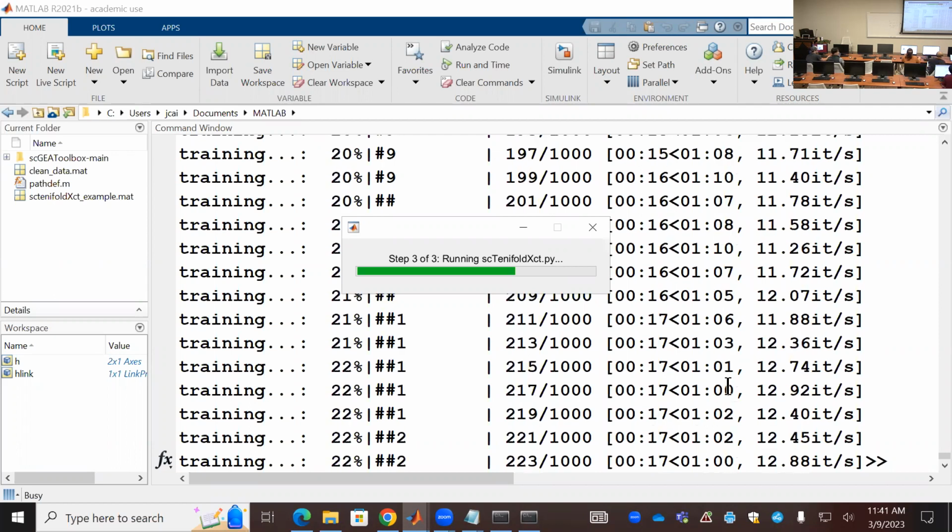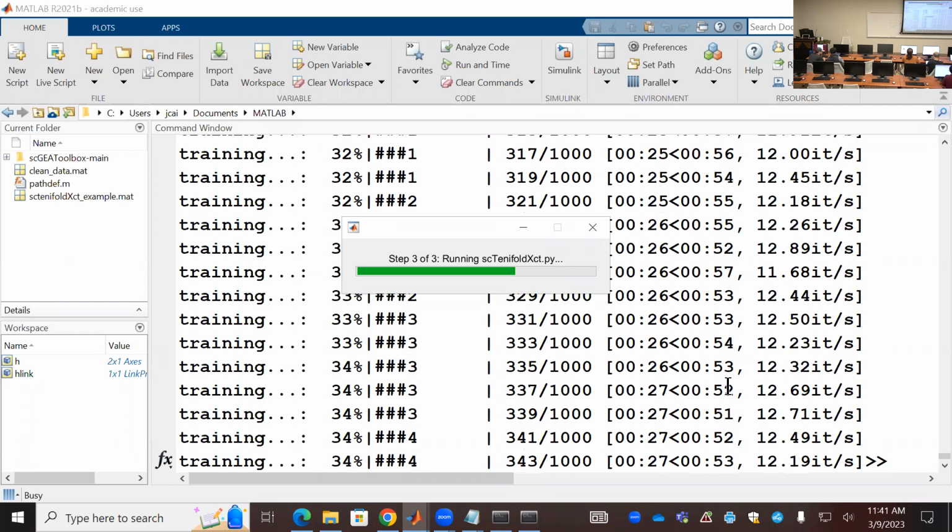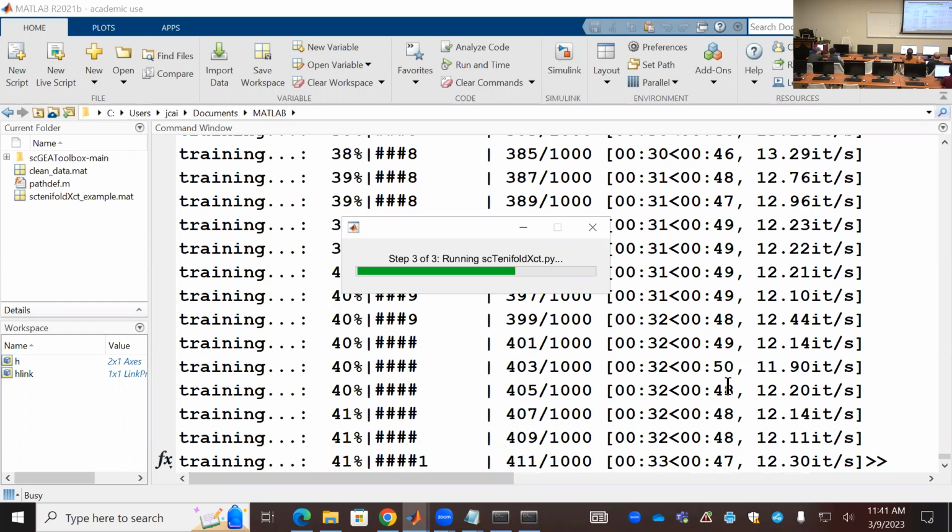Which cell type? If you have 3 cell types, you can select the first 2, or 1 and 3, or 3 and 2. You decide yourself. Oh, let's select endothelium cell and the stellate cells. That's for example.